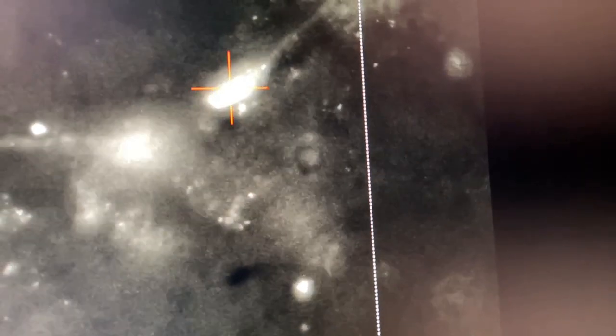No, that's DAPI. I don't care about DAPI. More than 5 seconds of exposure. Oh, I don't have an enhance button for this. Because that looks like a transfected cell here. Oh, this is so slow. But there should be a whole population of them, and you move slightly away from it and they just go away. That might be one in here, just out of focus.